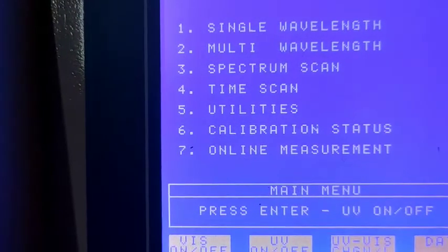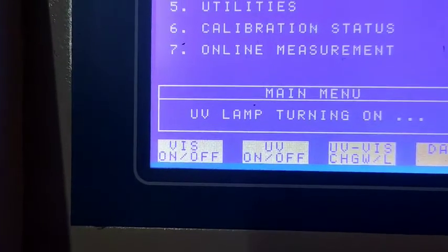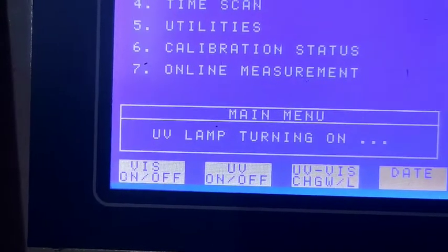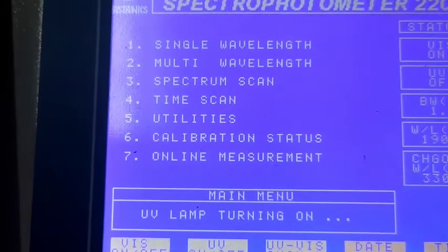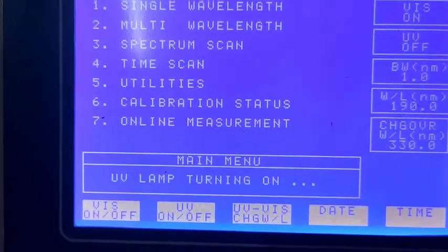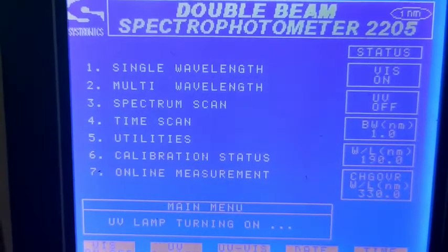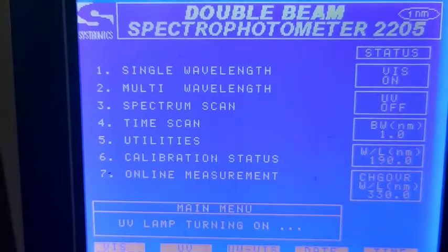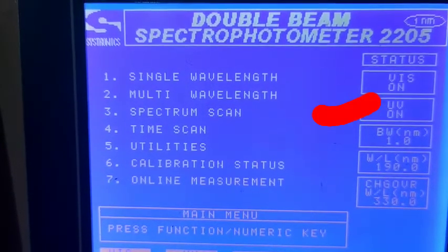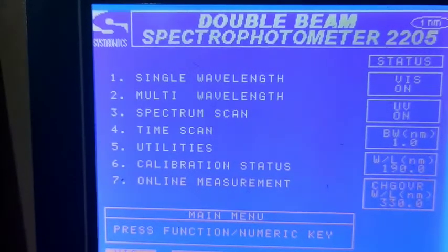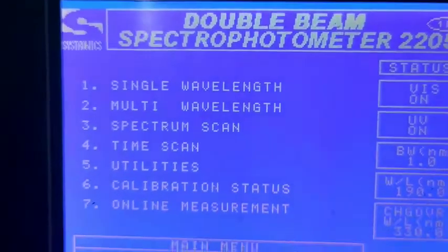After pressing F2, it will take a little time to get started. Then you will see the status that the UV lamp is on. You can see the UV lamp turning on — it takes two to three minutes. Within a minute it will be UV on, meaning the UV lamp will be on. If your sample absorbs in both the UV and visible regions, you can perform the practical on the same instrument. Now you can see UV on — both lamps are now on.